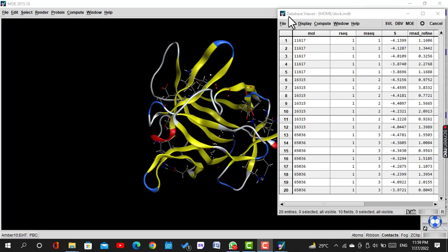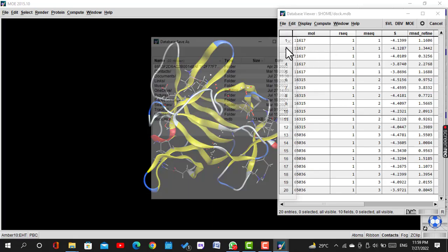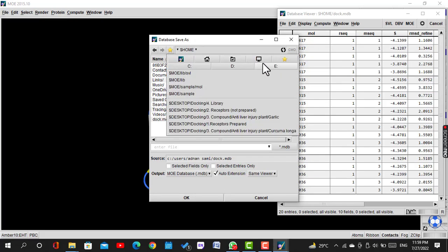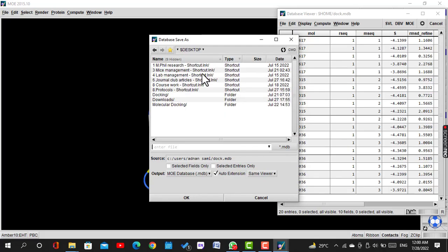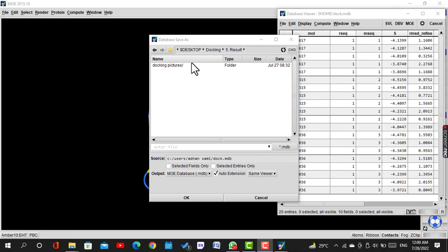A score file will come out. Click on File, then Save As. Select the folder you want to save data and name the data file. Then click OK.